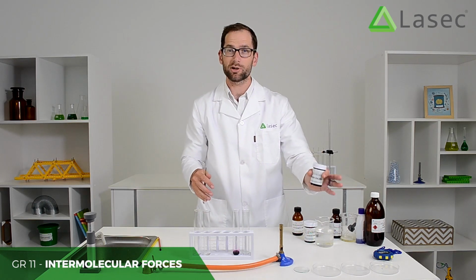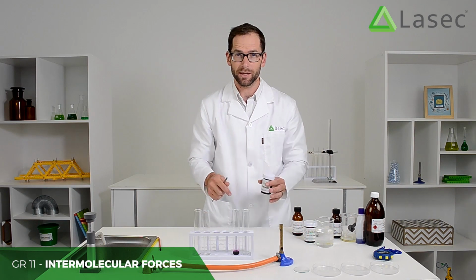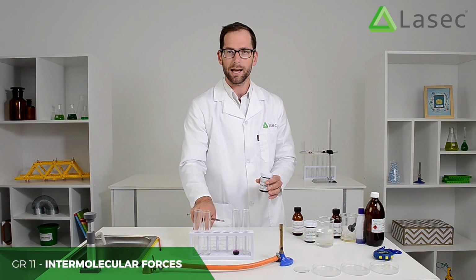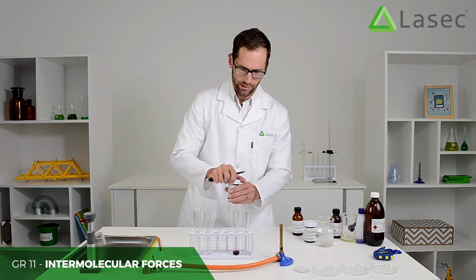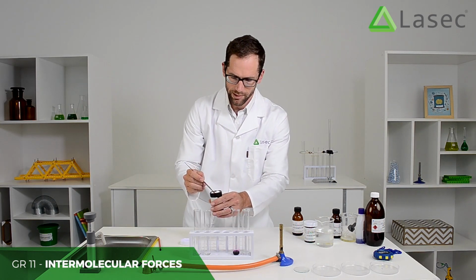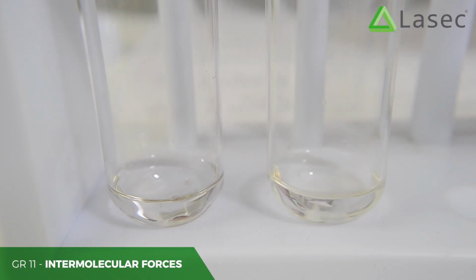Again, I've got my drop of water timing over there, and it hasn't yet dissolved after at least 40 minutes. So they'd need to time this. They're going to use another timer. You could use a phone as a timer, and time how long it takes to dissolve. Remember, this is something the learners need to do, and you can move around while they're doing it and observe.